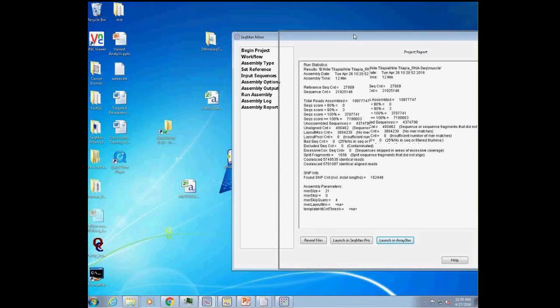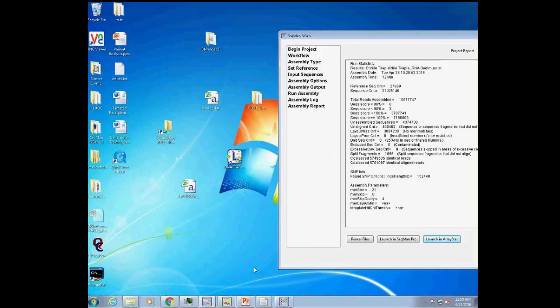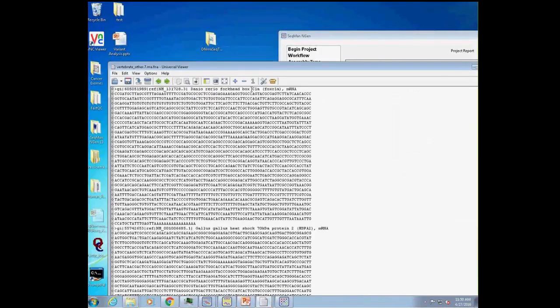We'll go and take a look right in the file. So this database, this FASTA file, is downloaded directly from RefSeq. It is the mRNA database for vertebrate other 7. There are, say, 100 of these databases that contain mRNA sequences for all the different non-mammalian vertebrates.